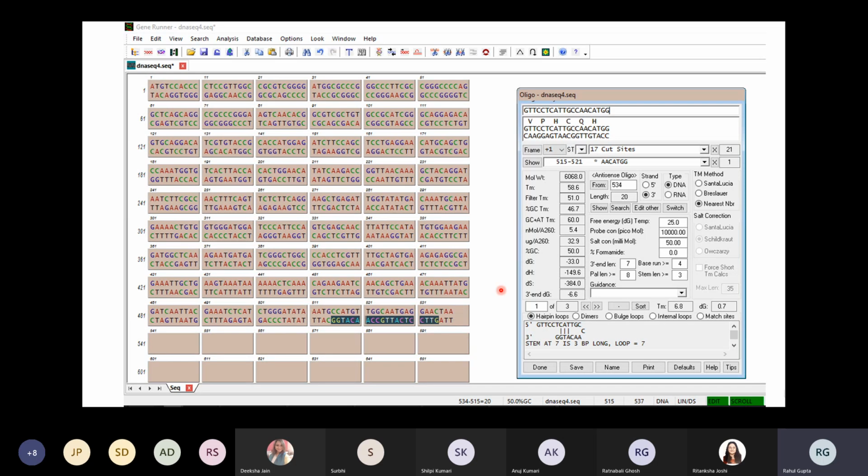Had I not taken the EGFP construct, I would have just cloned this particular gene in any particular vector. I would have taken the stop codon. But in this case, since we want EGFP to express as and when MET30 is expressed together as a fusion product, I don't want a stop codon in between. That is why from the reverse primer it has been excluded.